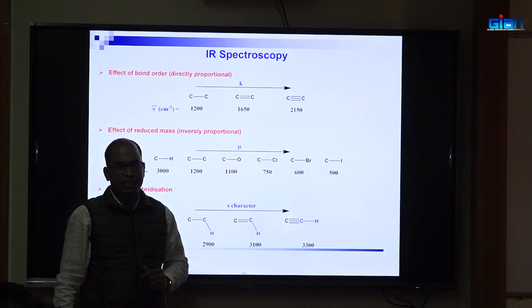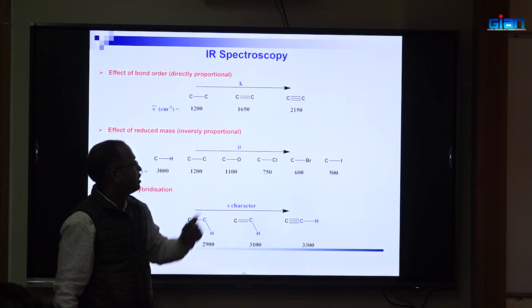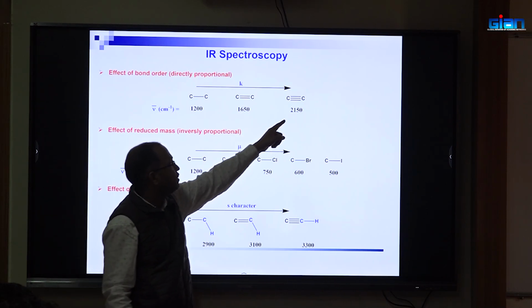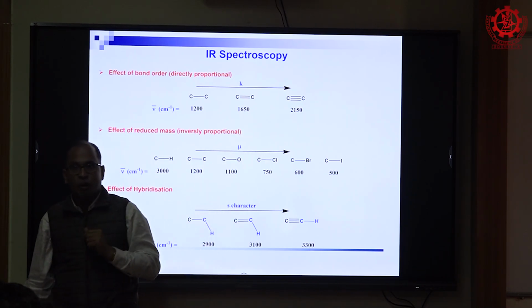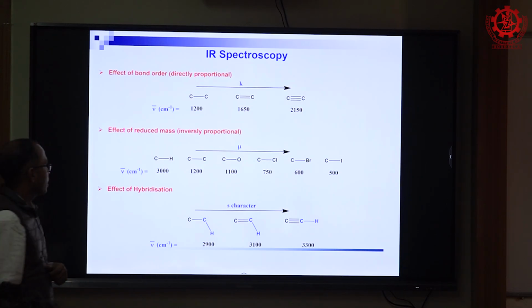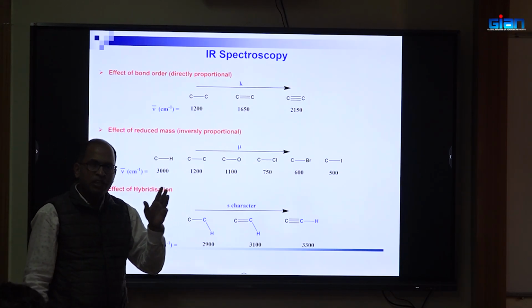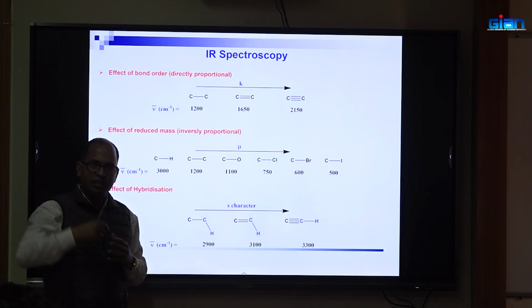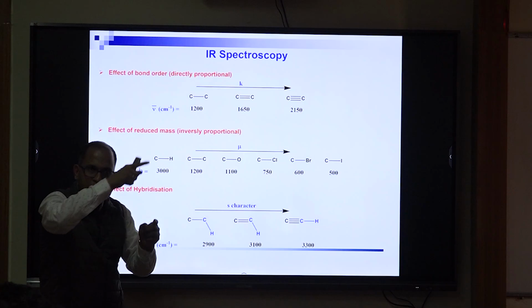You don't need to identify that one. But if you have an olefin, you characterize it because it is coming after 1400. If you have 2150, it is coming after 1400, so you characterize that one. Something you realize in the very left side, there is a broad peak, small one but very like this.